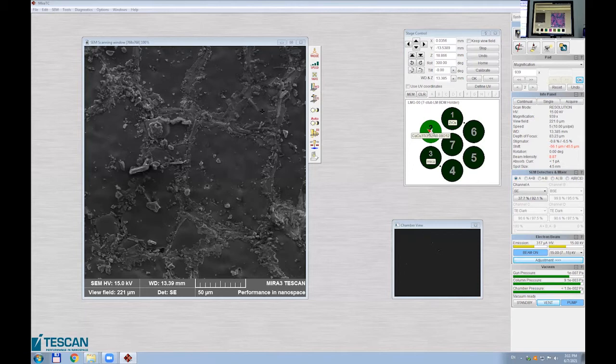It's not only about mapping, which covers the biggest area, but you can also use a line scan. If you have a different kind of sample where the elemental composition varies along a line, you can choose the areas, for example, through these boundaries, like that. Aluminum, copper, titanium, and calcium.